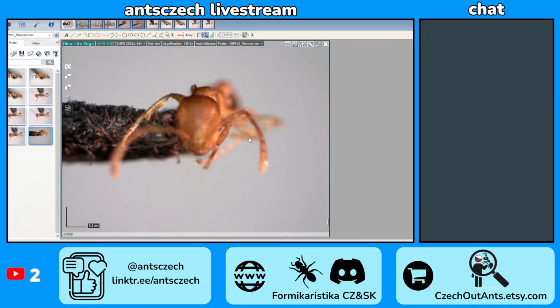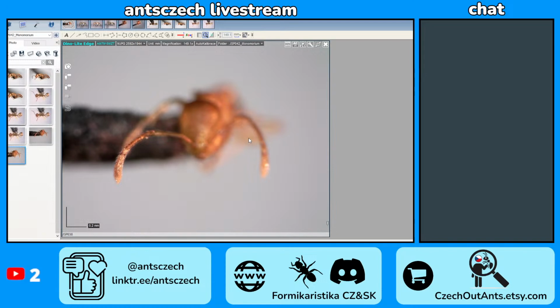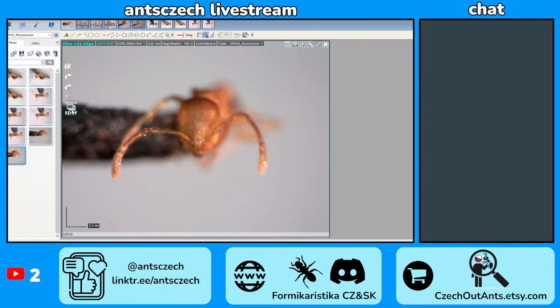Oh, nice. I just measured the Hypoponeras. I have right now 2 species in front of me. One is 3 millimeter and one is 2 millimeter. And the petiole, one is spiked and one is like a cube. Yeah, but they're both black. So basically, one is half of all Hypoponeras and one is the other half from the black ones.